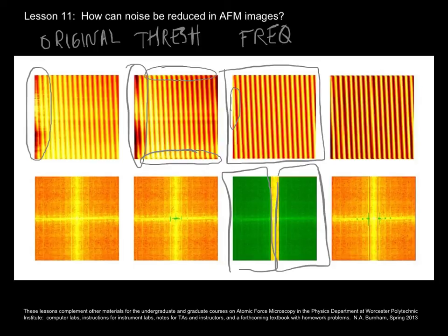So, of course, what you would naturally want to do, and it is possible, is you do them both. You do both threshold and frequency filtering.